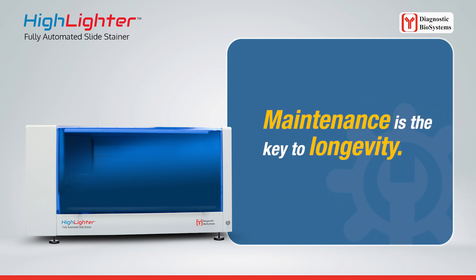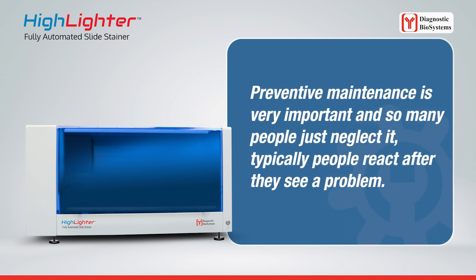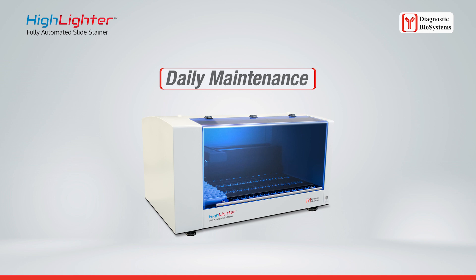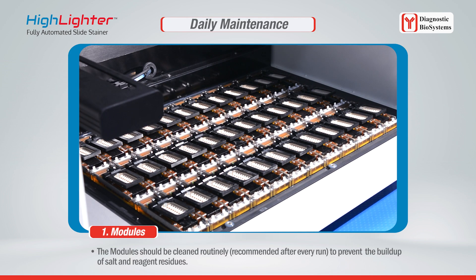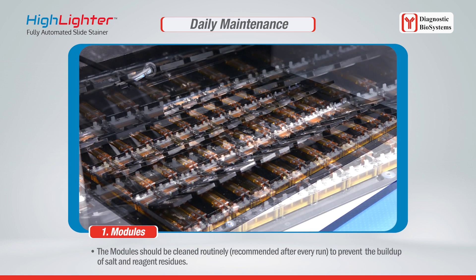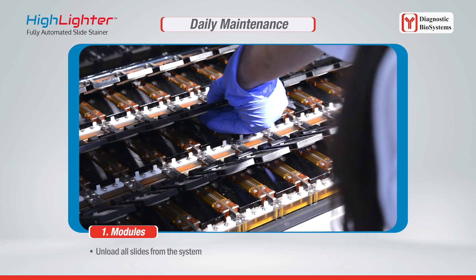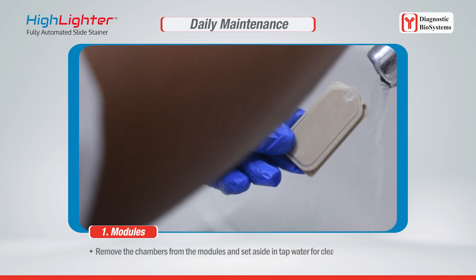Maintenance is the key to longevity. Preventive maintenance is very important, and so many people just neglect it. Typically, people react only after they see a problem. For daily maintenance, the module should be cleaned routinely — recommended after every run — to prevent the buildup of salt and reagent residues.